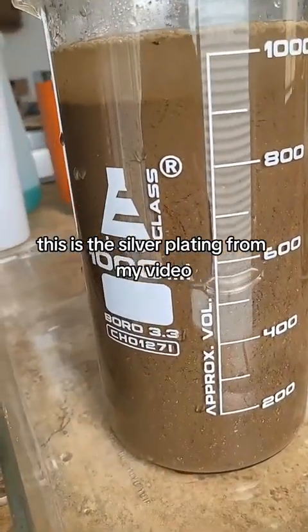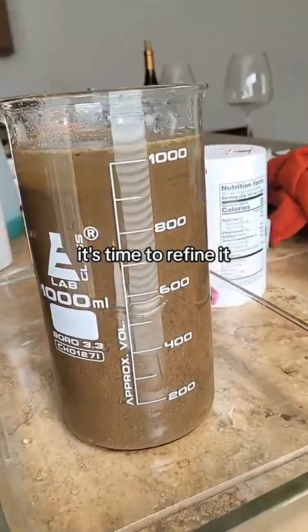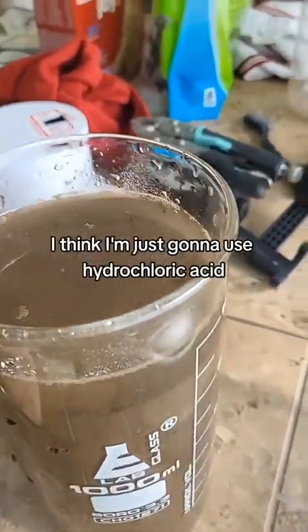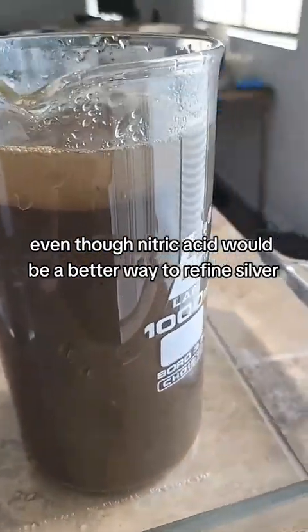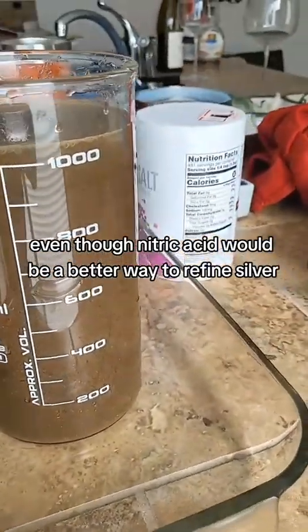This is the silver plating from my video — it's time to refine it. Since there's so much of it, I think I'm just going to use hydrochloric acid, even though nitric acid would be a better way to refine silver.